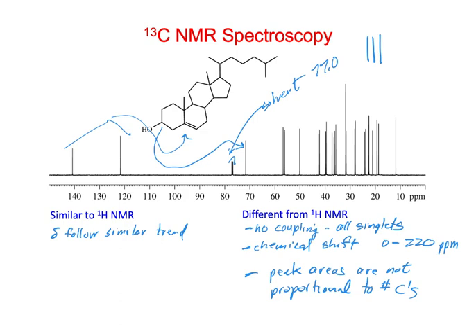But so like Steve was doing, he was using a small amount of deuterium with a larger amount of protonated solvent. So he needs enough deuterium in there to lock the signal so it doesn't wander during the experimental time. And you could do something like that here as well. Or you can actually have these tubes that have a small inner tube, and you could have some deuterated solvent in there too, and not in your actual sample.